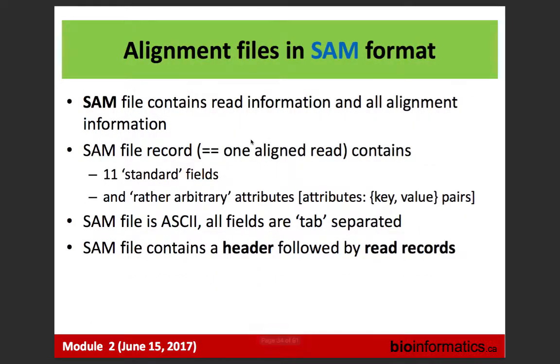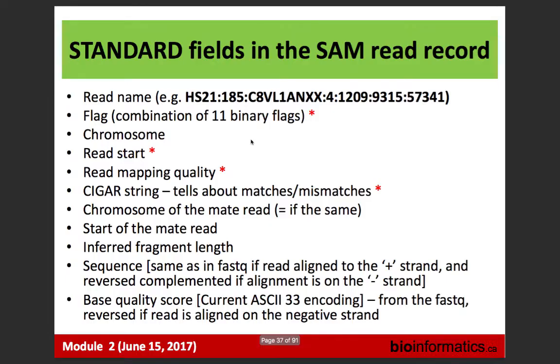So I would like to skip this, and this is exactly those green headers that we will talk a little bit about, because I'm a little afraid that we will not have enough time. So this is basically about a file and a format. The SAM file is the standard alignment mapping format. It has 11 obligatory fields and then some optional fields. And basically, a question to you: what should this alignment file contain?